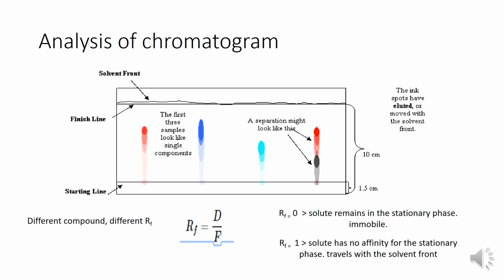The chromatogram is the paper chromatography we use in the separation. It consists of spots representing different types of compounds, which can be recognized by their different colors. To know what compound each color represents, we calculate the RF value. Different compounds will show different RF values.